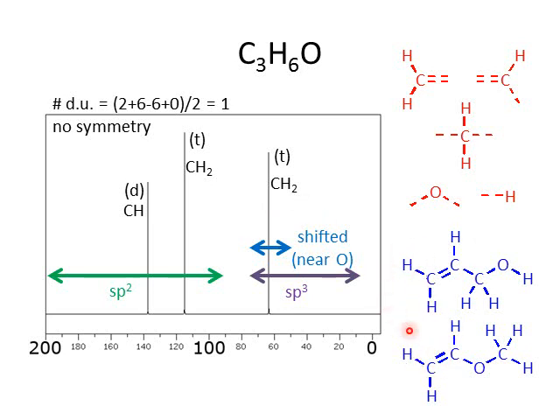This one has a CH2, a CH, and a CH2. That other hydrogen isn't attached to any of the carbons. This one has a CH2 here, a CH here, and how many hydrogens here? Oh, 3. That doesn't work. And so I know that it can't be that. If I had other information, like if I had an IR, that would also be very helpful. Because, for instance, in the IR, I would see a very strong signal for the OH.